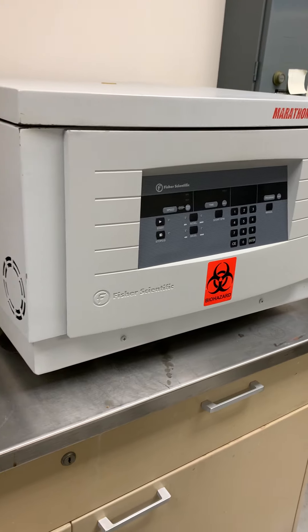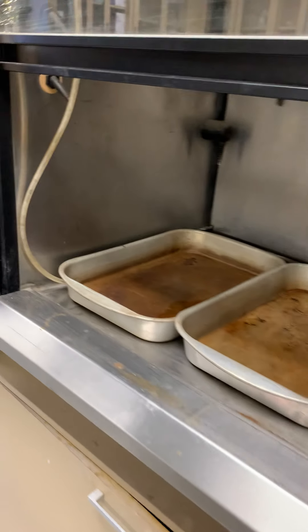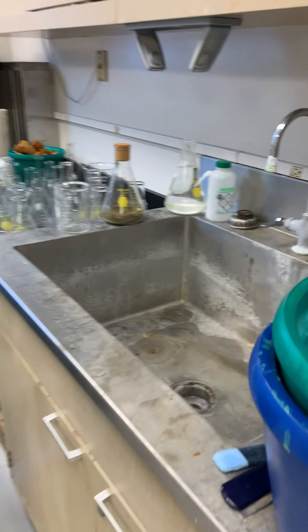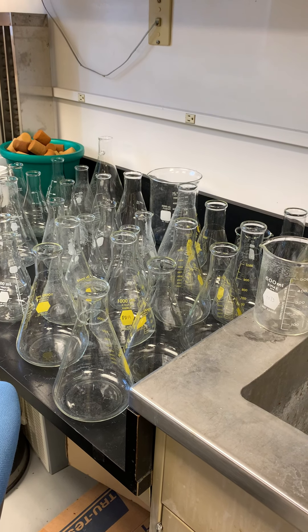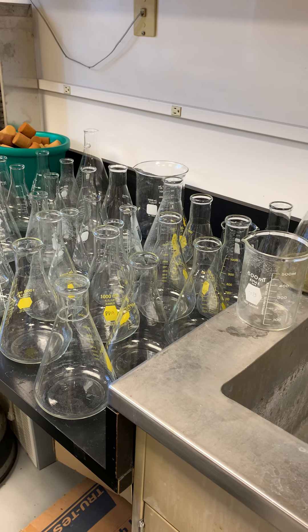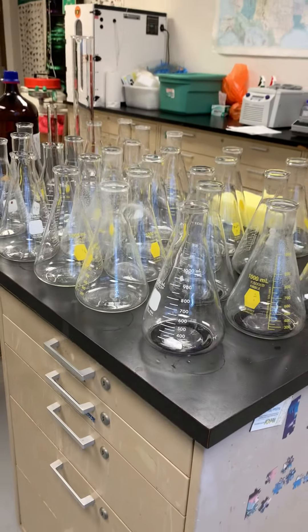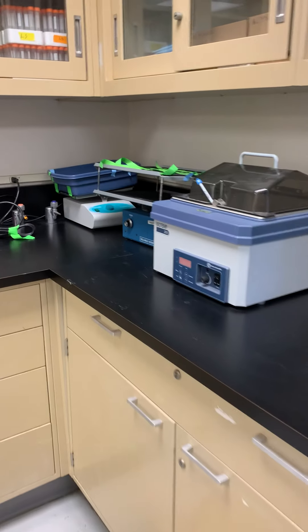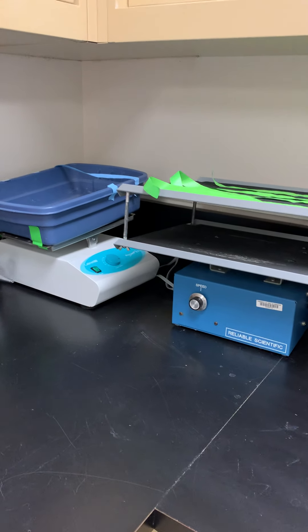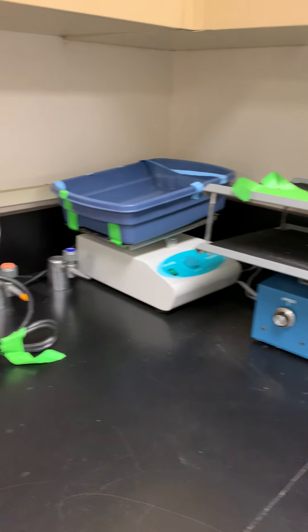I have a centrifuge here. I also have another hood here for drying the culture or something like that. There's a sink and lots of 500–1000 ml Erlenmeyer flasks for culture production. I have two shakers, and we use them for mycotoxin extraction and sample extraction.